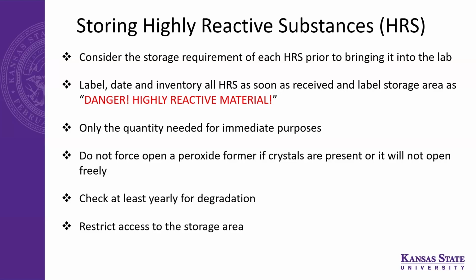Whenever you order, order only the required amount for immediate purposes. Do not force open a peroxide former if crystals are present or it will not open freely. That's very important in the case of peroxide formers. Check at least annually for degradation. Restrict access to the storage areas, because these are highly reactive substances, so it's always better to keep the access restricted.